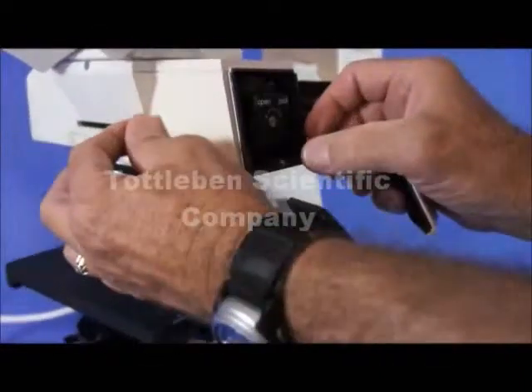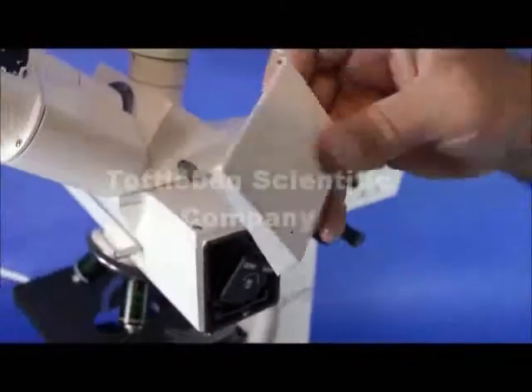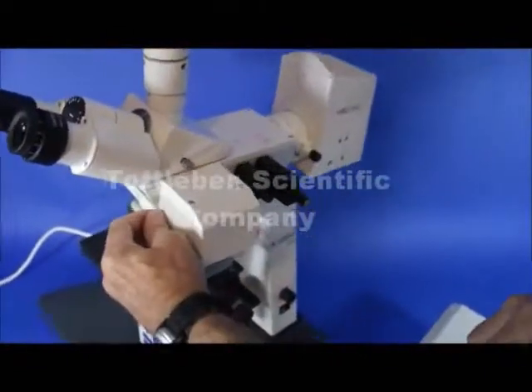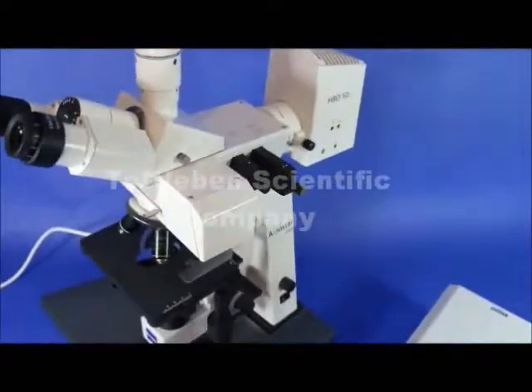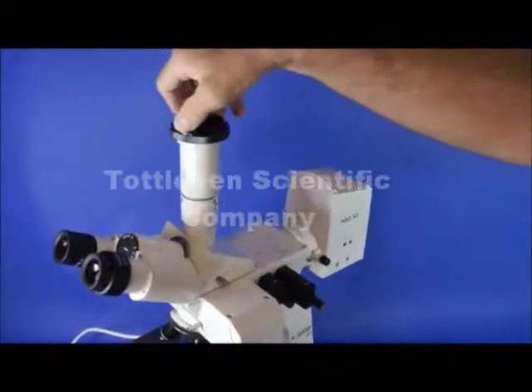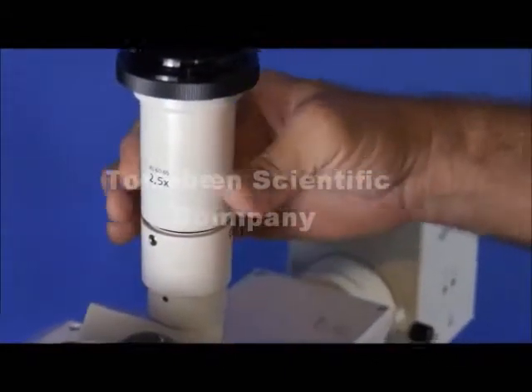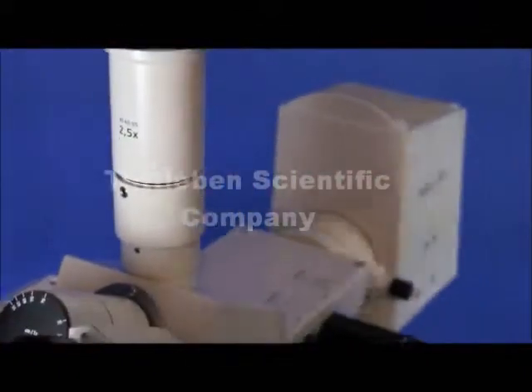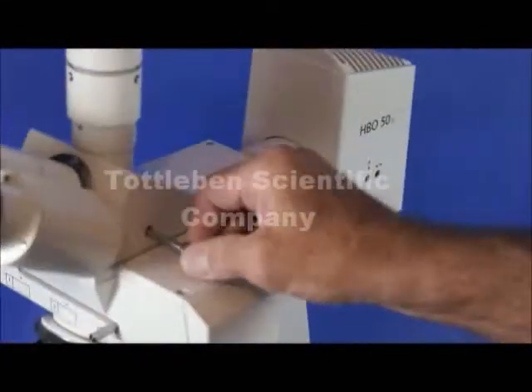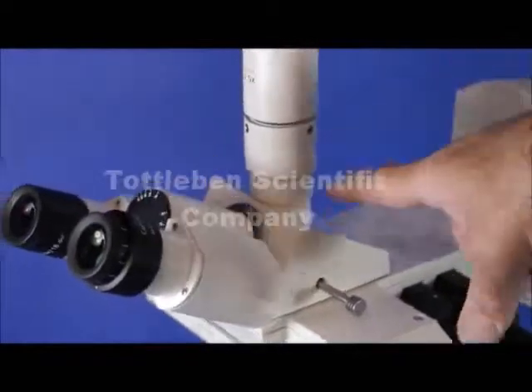Just push that back in and turn the knob. You can also remove this part and put on a C-mount video adapter and attach the C-mount video camera of your choice. It has a light path selector so that you can direct the light 100% to the camera — pushed all the way in — and also to the port for photography when pulled out.